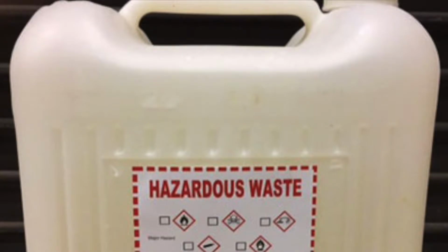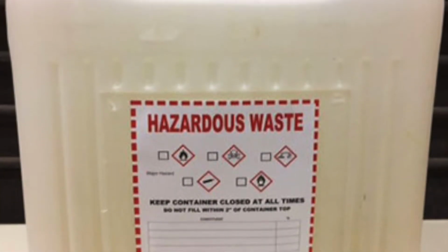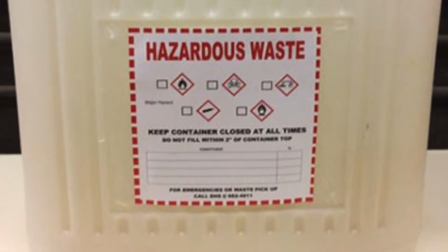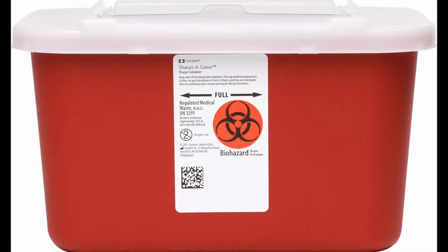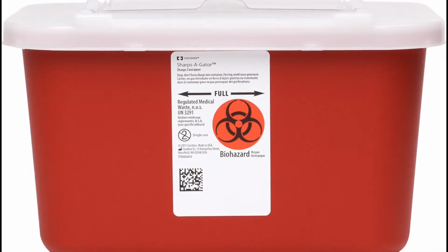Once the trial was over, the solution was poured into the hazardous waste container since it contained the beads created from the alginate solution. The beaker was then cleaned and left to dry. The syringe used to take the sample was placed in the sharps container, and the cuvettes were cleaned to ensure that no alginate was in them. They were then disposed of in the proper waste container.